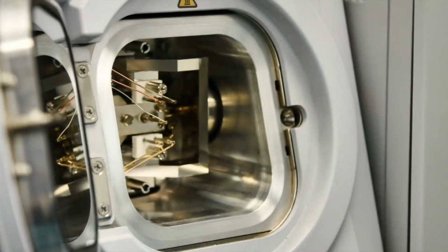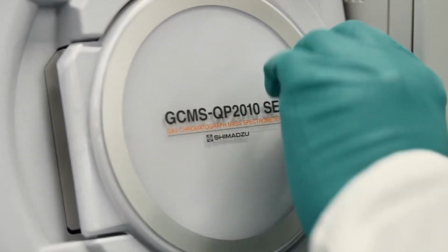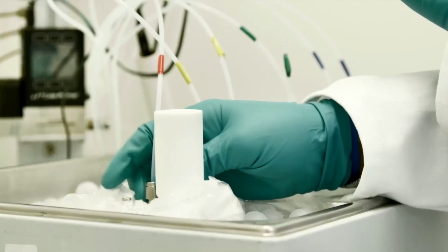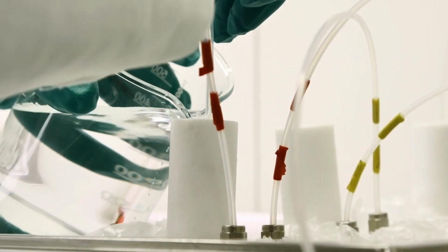So here we have the gas chromatograph and mass spectrometer, also known as GCMS. This setup is very similar to our GC-FID setup, where we have the same permeation system in cells and nitrogen flow taking the permeated chemical to the GCMS. The main difference here is, instead of using a flame ionization detector, which burns up the chemical to be detected, we're using a mass spectrometer. This not only gives us how much of a chemical is permeated, but also tells us key information about what that chemical is. This is especially important for mixtures.